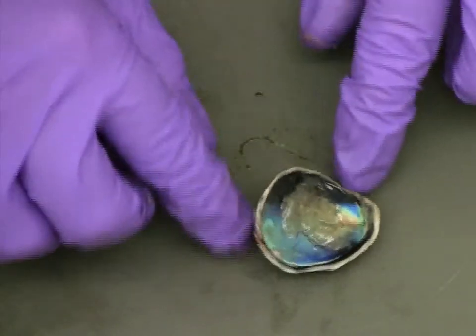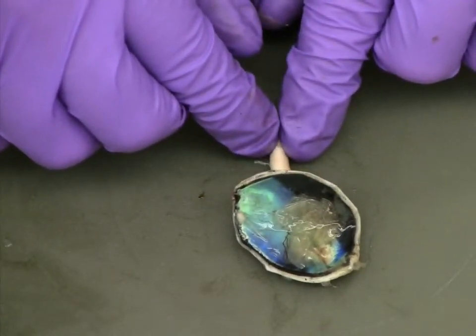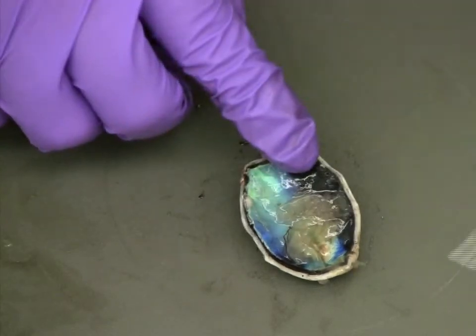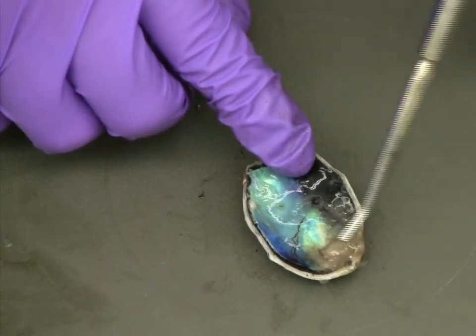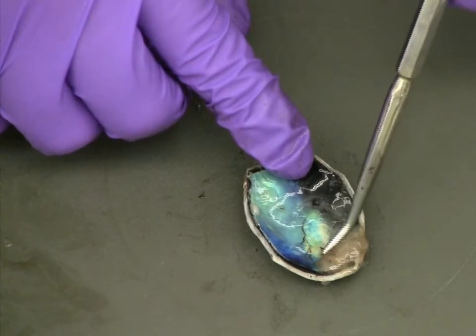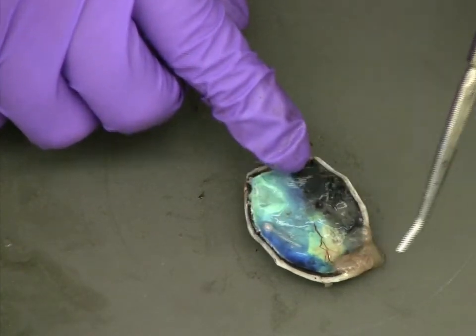Looking at the back half of the eye that was set aside earlier, we can now get a closer look at the retina. In a fresh cow eye, the retina can be extremely fragile and can shift during the dissection. Some of the retinal tissue on this eye has lost its original form, but the original blood vessel structure is still clearly visible.